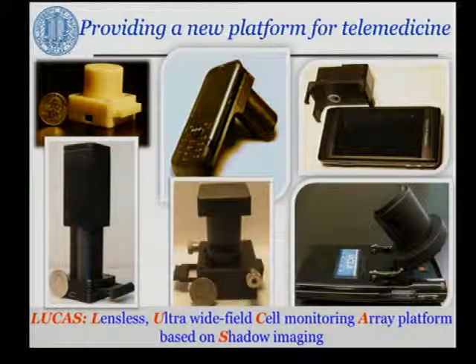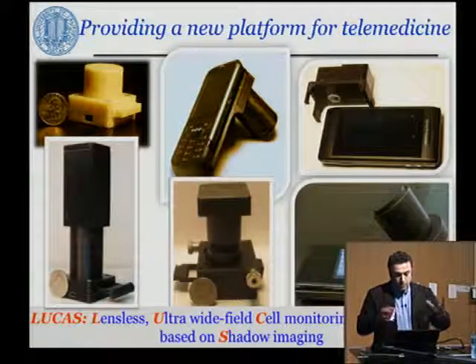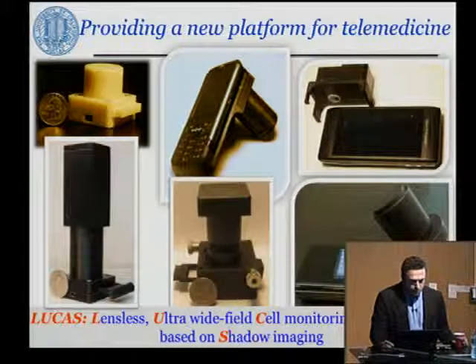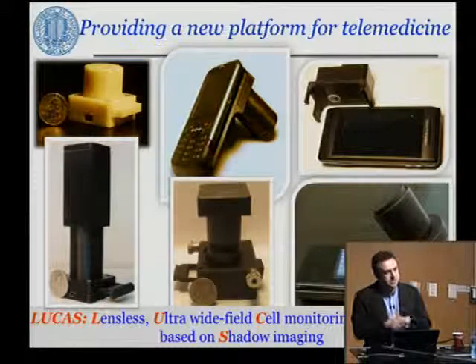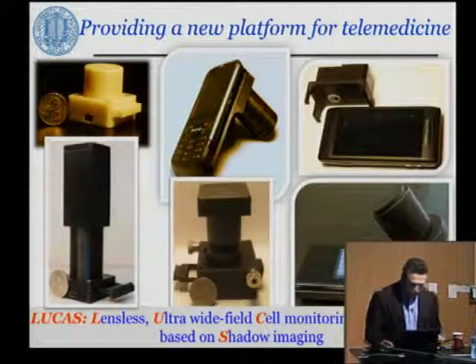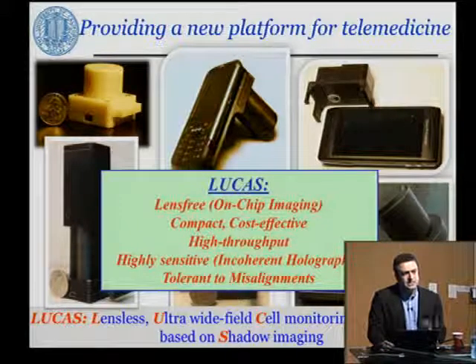Now I'd like to come back to talk about microscopy, starting with the first example that I gave at the very beginning of my talk, saying that the mobile phone itself, together with the CMOS imager and how it's been improving its space-bandwidth product, you can actually look at a new microscopy platform integrated with the mobile phone interface. So this is quite important because microscopy is a tool that is almost universal and finds many applications in different fields.